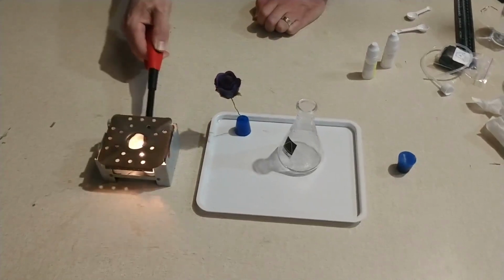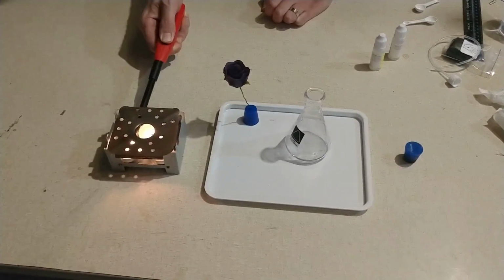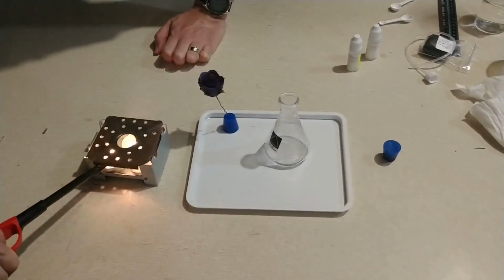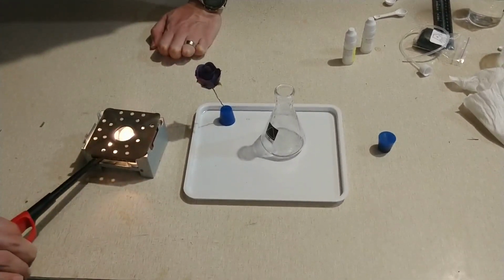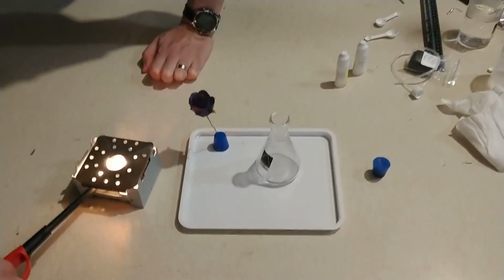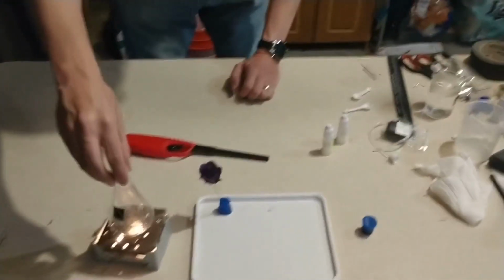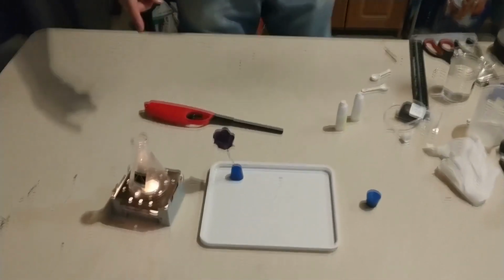So I'm going to start my candles here. And I'm going to put the flask over the heat here so that we can heat up the mixture that's down inside there.